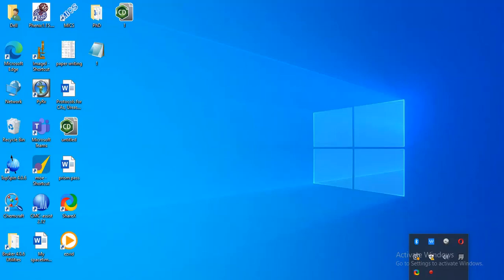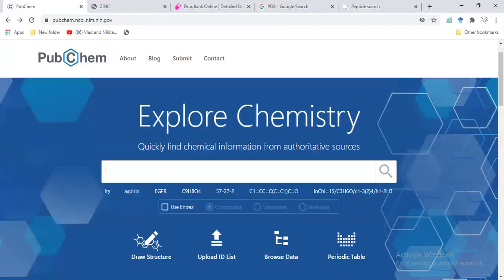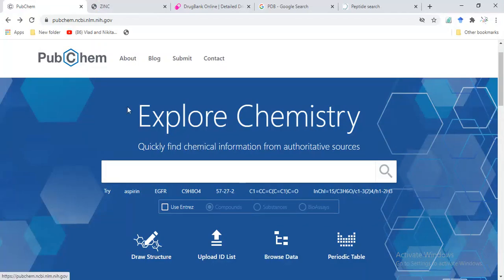Dear viewers, in this video we are going to learn how we can retrieve small molecules and macromolecules from different databases. First of all, I will show you PubChem. This is a database to retrieve small molecular structures.